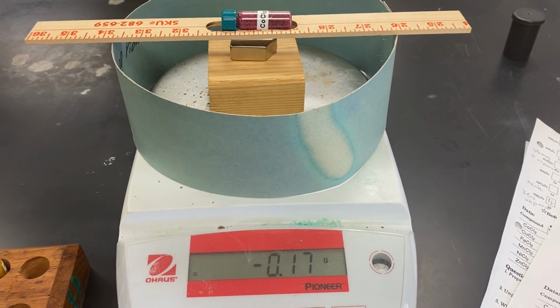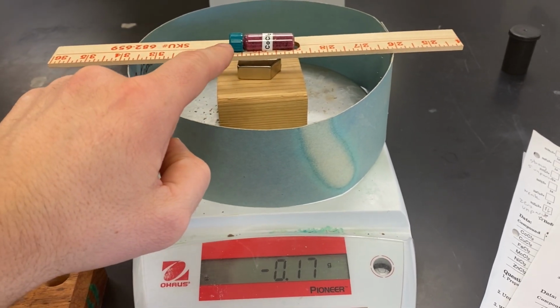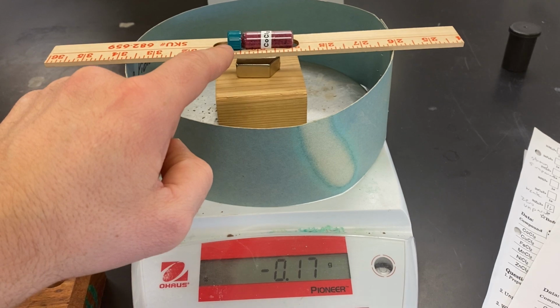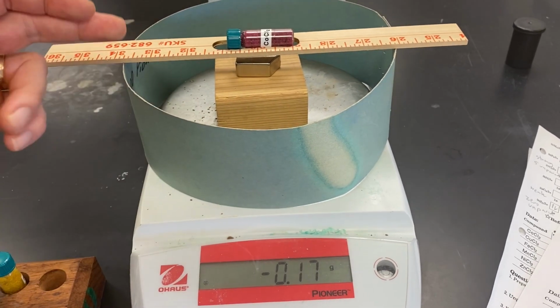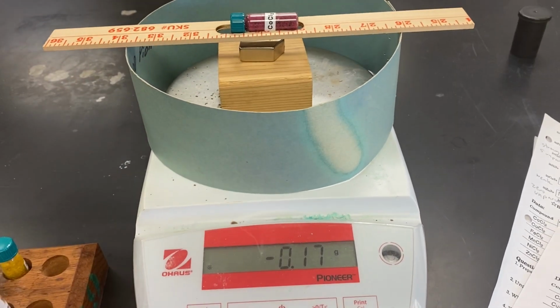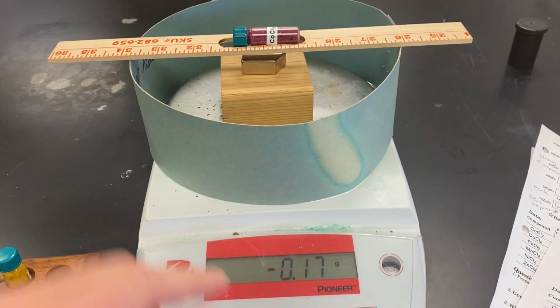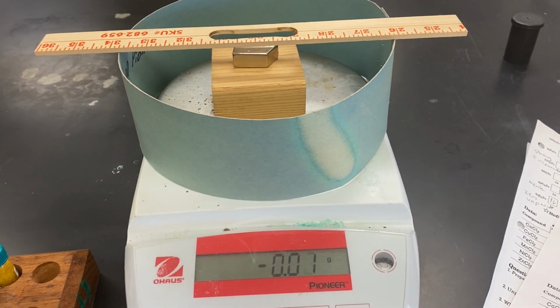So essentially what's happening is this sample in here has magnetic properties, which is pulling this magnet up. And since it's suspended around this piece of cardboard here, I get a negative number on my reading. Now, if I take this off, it should go to 0.